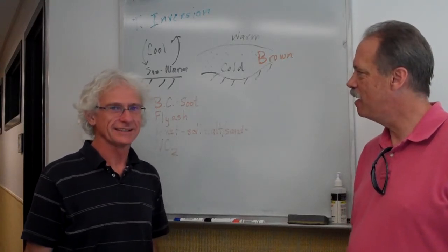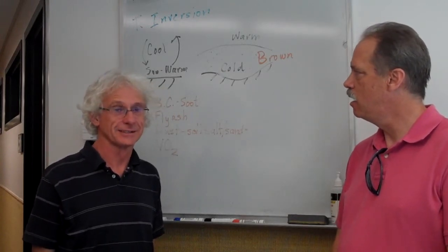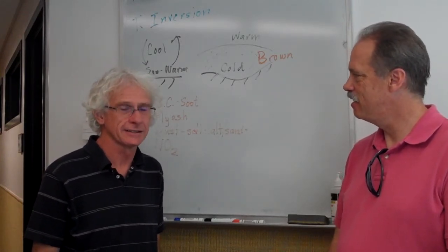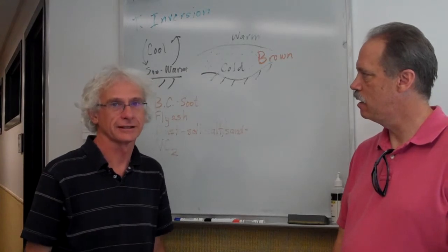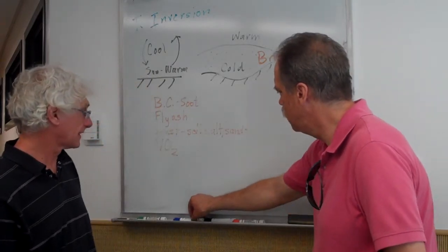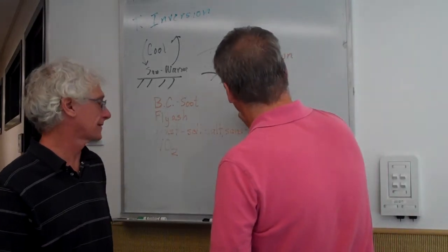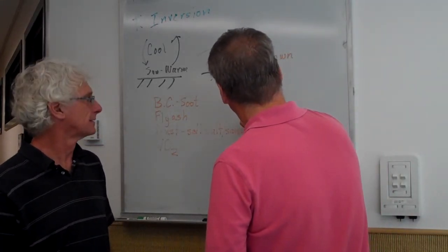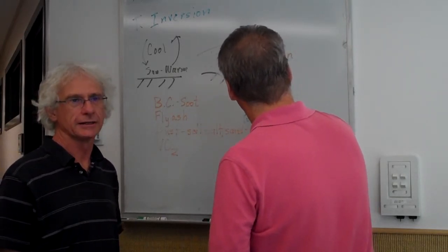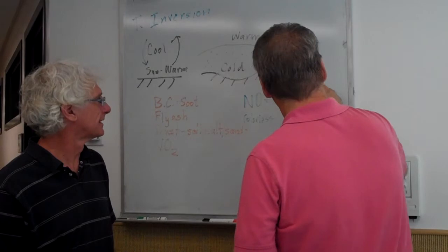Yeah, and so we're going to go into the lab shortly and do a little demonstration and try to see some NO2 being formed, make a little brown cloud ourselves. And nitrogen oxides are emitted by cars and factories, mostly as NO, nitric oxide, and then the NO gets converted pretty rapidly to NO2, which is a brown color. And so we're going to use some of the properties of these molecules to detect them and to try and measure the rate that the NO2 is being formed. So we'll take a look at that shortly.